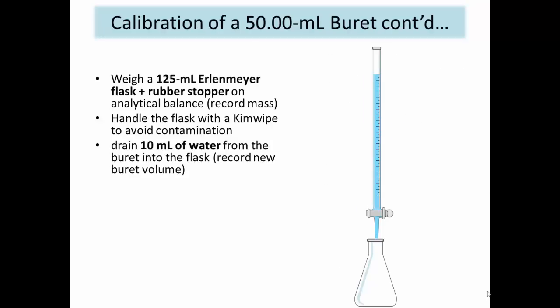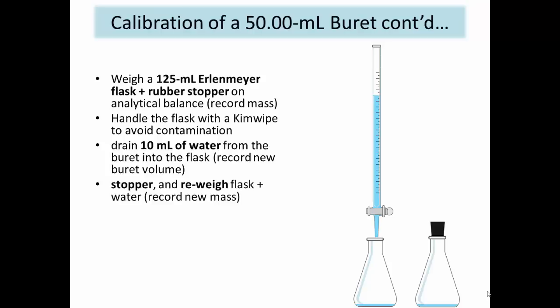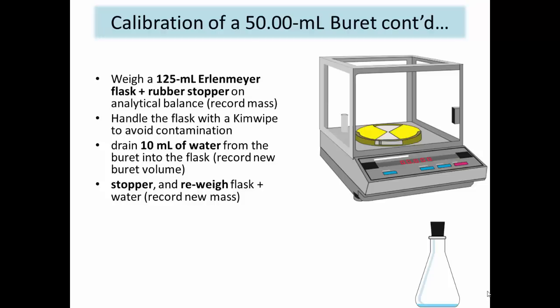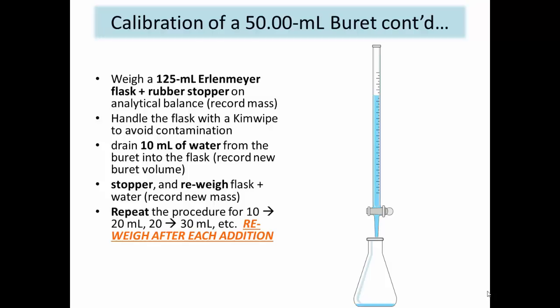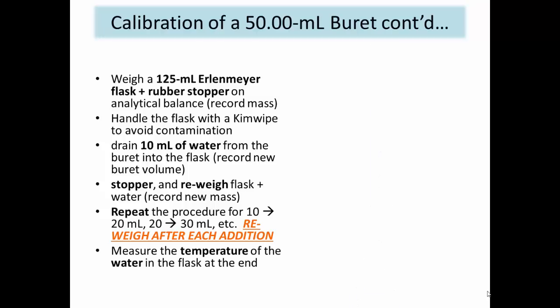Drain 10 ml of water into the flask, recording the final volume of the burette to two decimal places. Stopper and re-weigh the flask, now containing the 10 ml aliquot, on the same balance as previously used. Repeat this procedure with the remaining contents of the burette, adding 10 more milliliters to the Erlenmeyer flask and recording the new burette volume and new flask mass after each addition. Stop when you reach a volume of 50 ml on the burette. After the 50 ml of water has been added to the flask, record the temperature of the water in the flask.